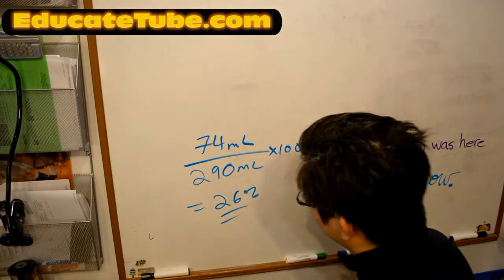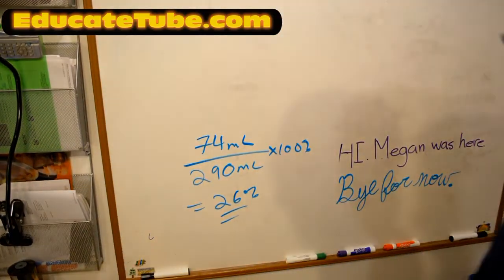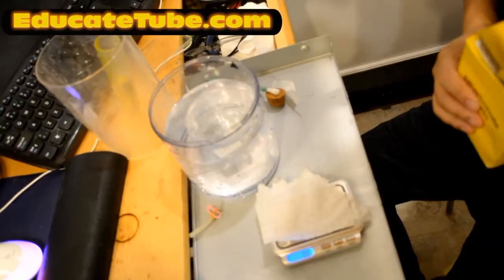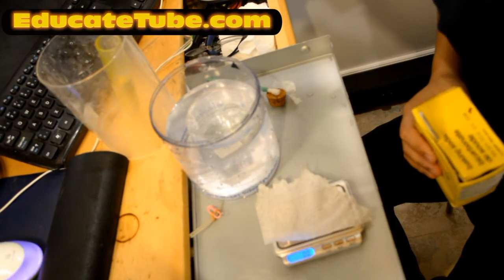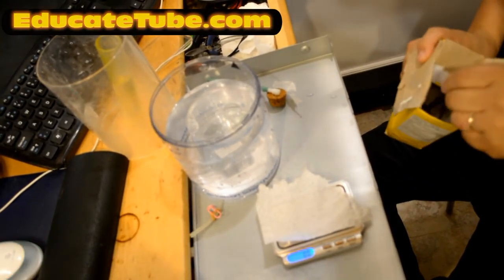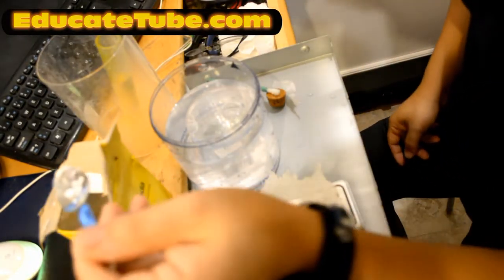Alright, let's do it again, one more time. I did learn from it though. There was a lot of gas escaping, so we need to account for that. Okay, let's add 1 gram for the second time. Okay, we got 1 gram.